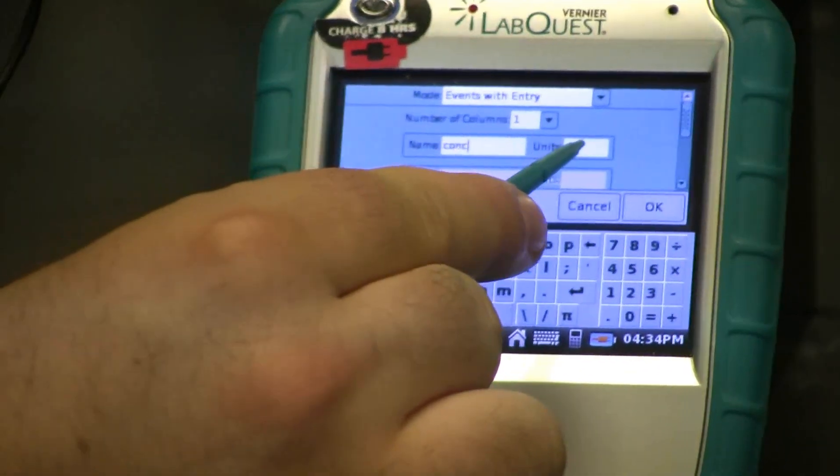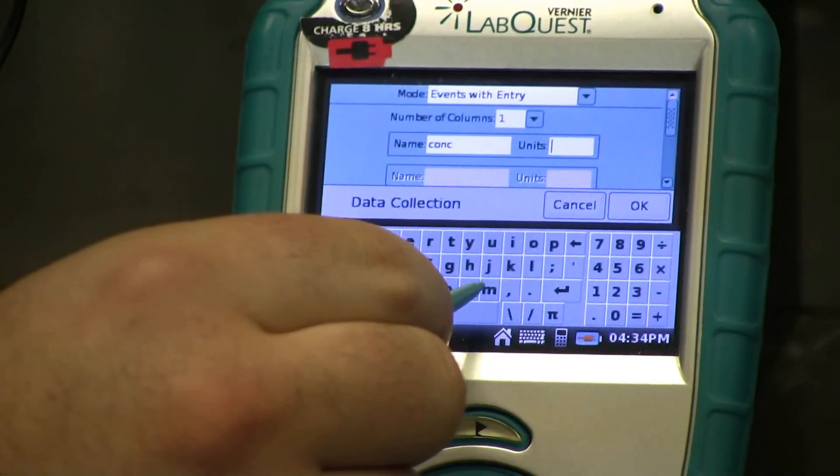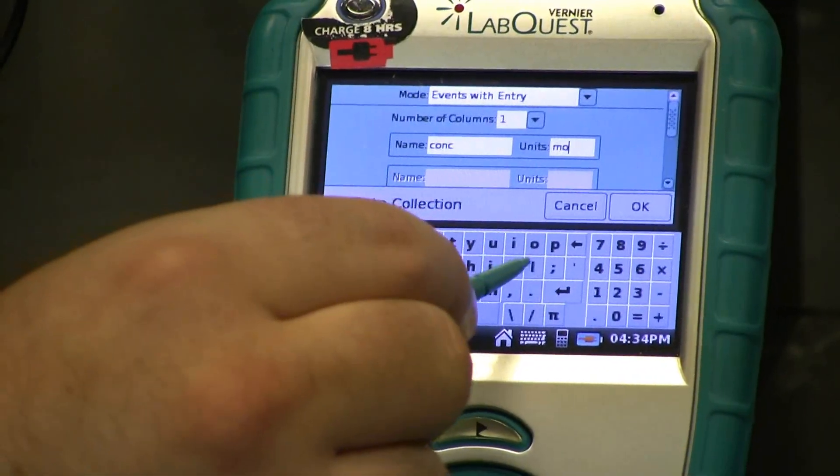In the Unit box, you want to click on this and enter moles per liter or an abbreviation of such.